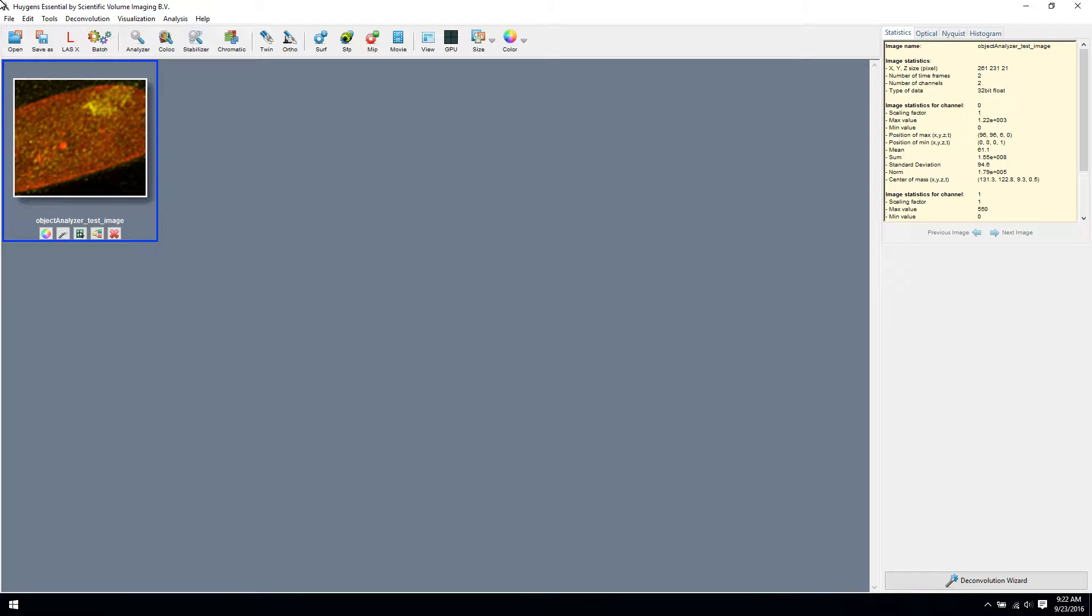To start the tool, simply press the magnifying glass whilst having the image thumbnail selected of the image you want to analyze. A download link to the image we are going to use is included in the video description.